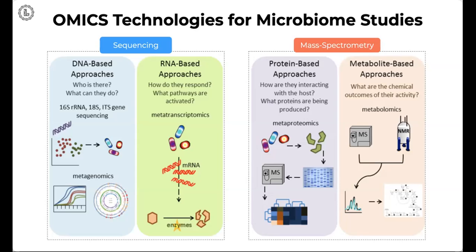And what does this method give us? This method will help us build a survey of the members of the microbial community under study. It will help us understand their proportional abundance, like how many of these members are present in what number, right? And they can be probed for their uniformity across different conditions, or across different sample types that we are trying to understand the pattern of.